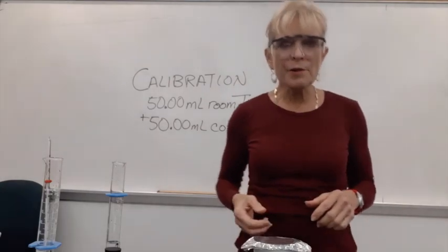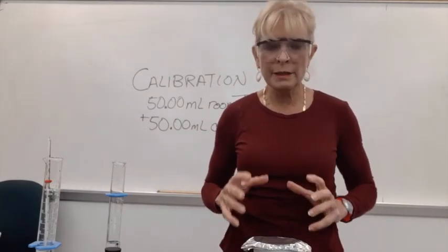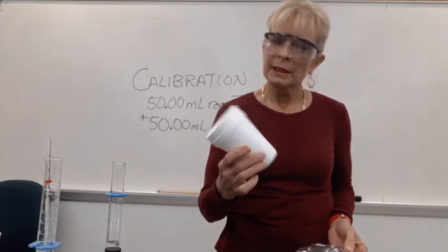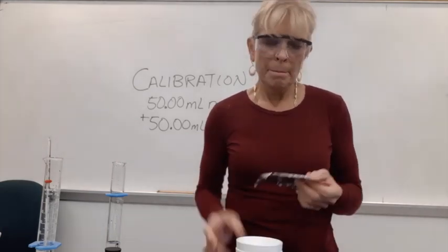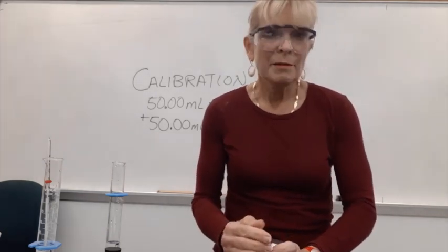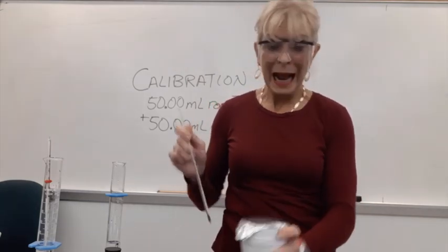Thermochemistry. This is the section where we show you what we actually do in the experiment, the wet chemistry. And we need to make our calorimeter, which we make out of 2 large styrofoam cups, a lid, aluminum foil, which goes on top. And then, here's the fun part of the experiment.